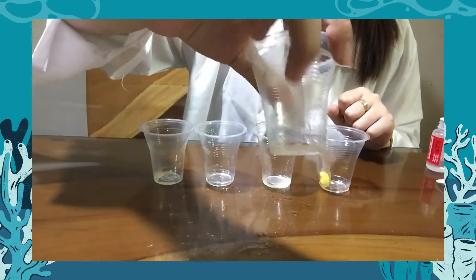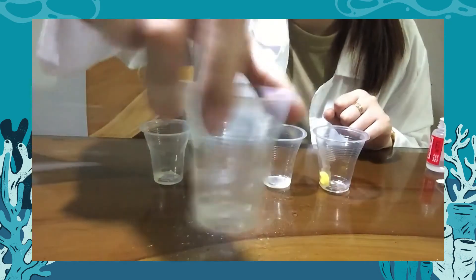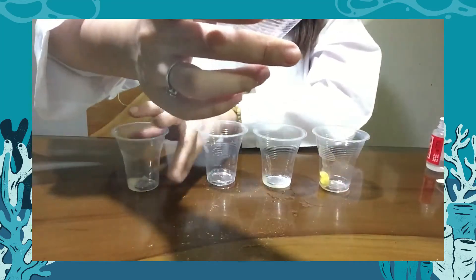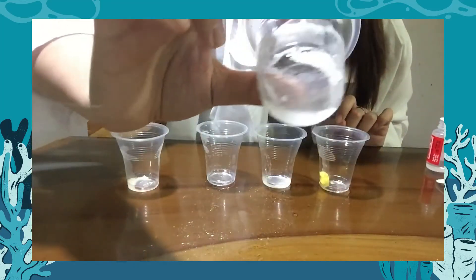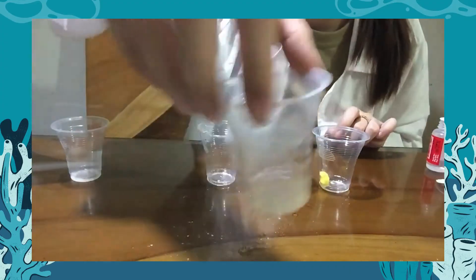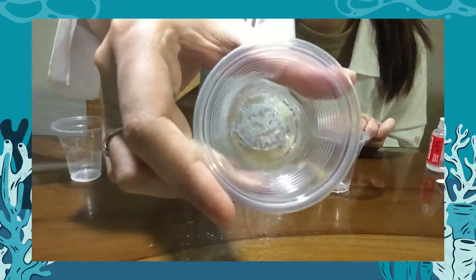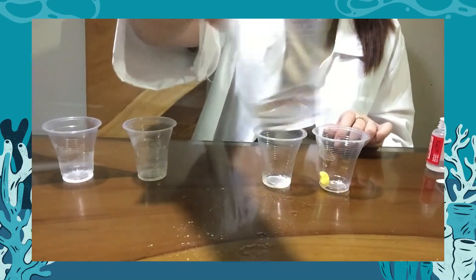Let's see if sodium chloride will dissolve in 1 ml of acetone. After shaking, there are still some particles — unlike with water. Next is the sugar with acetone. After shaking, there are still some particles — sugar did not dissolve in acetone either.